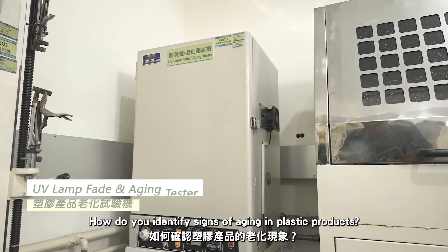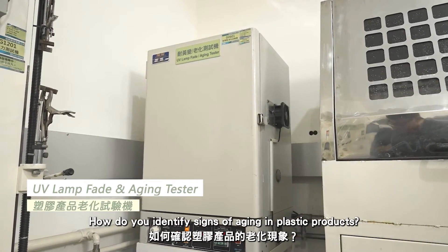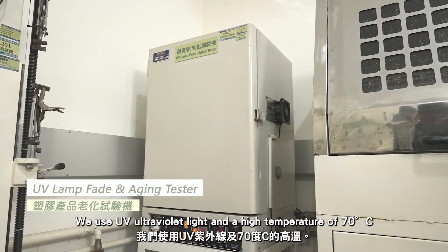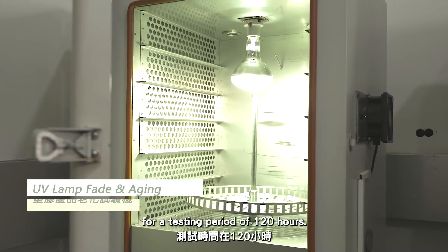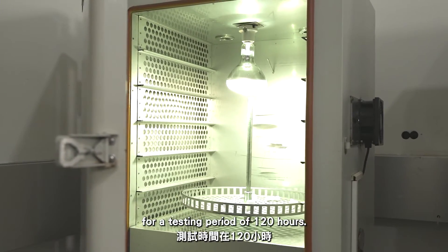How do you identify signs of ageing in plastic products? We use UV light and high temperature of 70 degrees Celsius for a testing period of 120 hours.